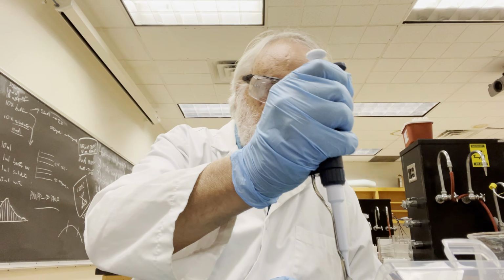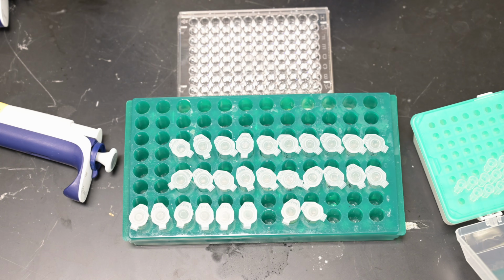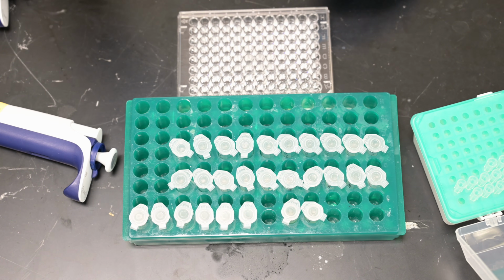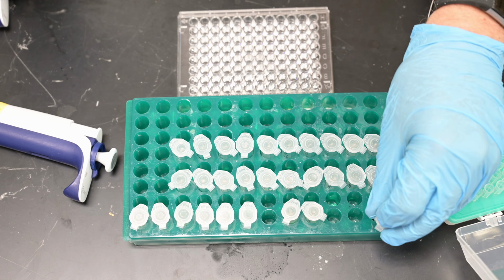What I'll do here is the lysate sample. I will add 20 microliters of the lysate to A1. Then I will add 10 microliters of the lysate to A2. And then we'll load 5 microliters to A3. So the lysate's been done.